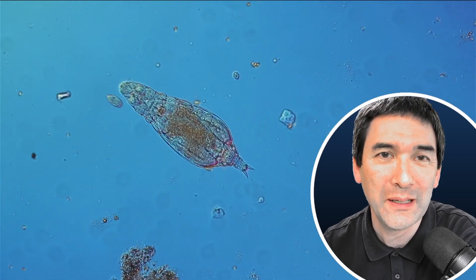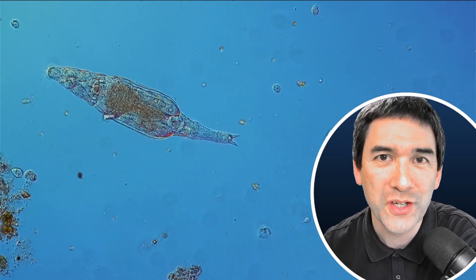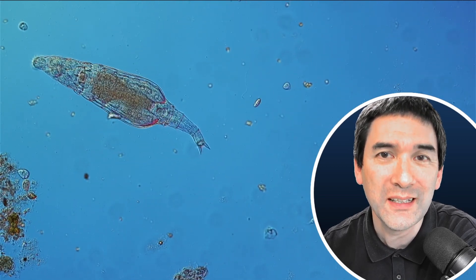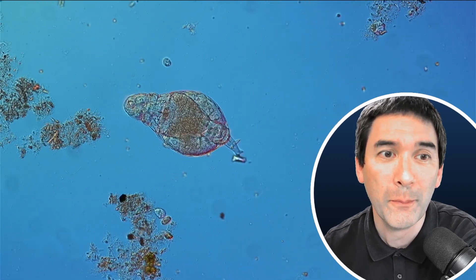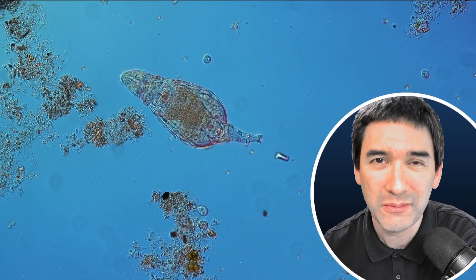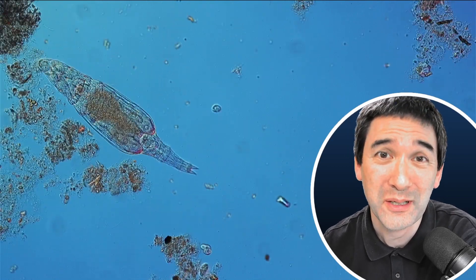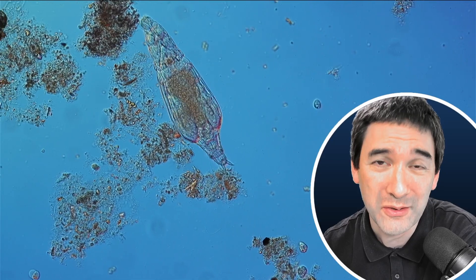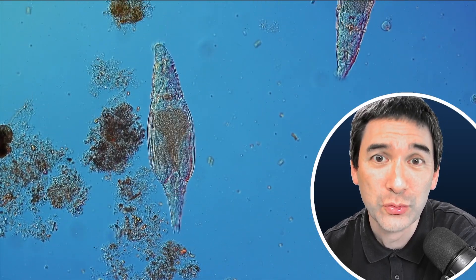You can also see that there are plenty of smaller creatures swimming around — these are mostly ciliates. They're single-celled, those ciliates. Rotifers, however, are multicellular animals. So actually, they don't really belong to the microorganisms because microorganisms, strictly speaking, are single-celled. Those rotifers are actually true multicellular animals.